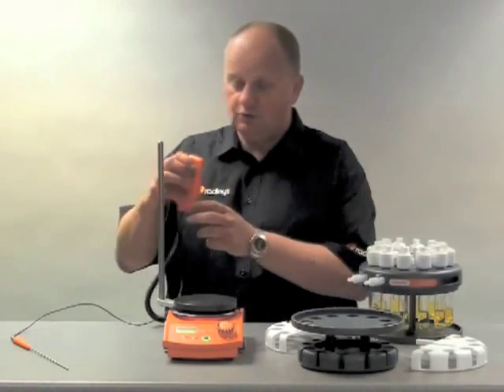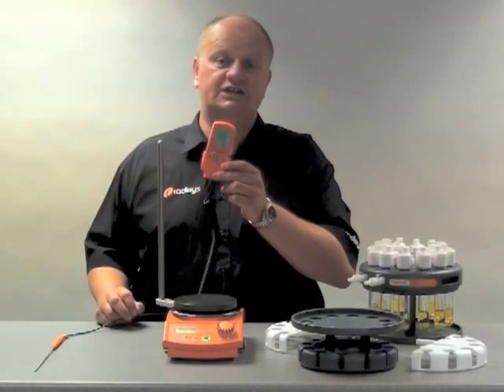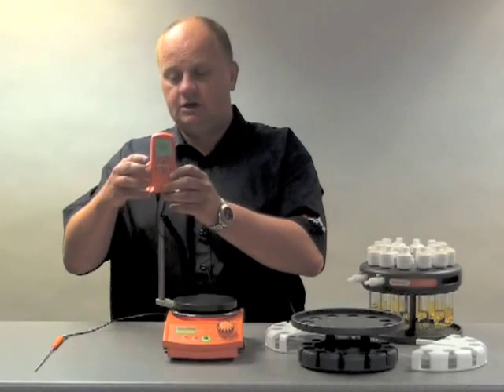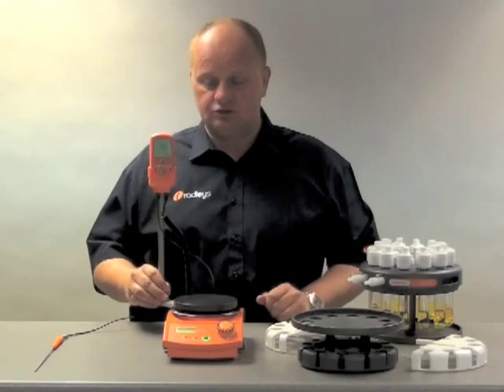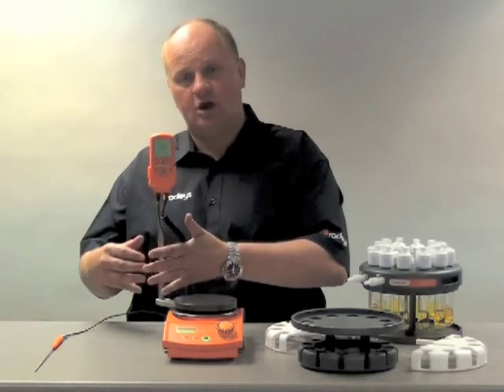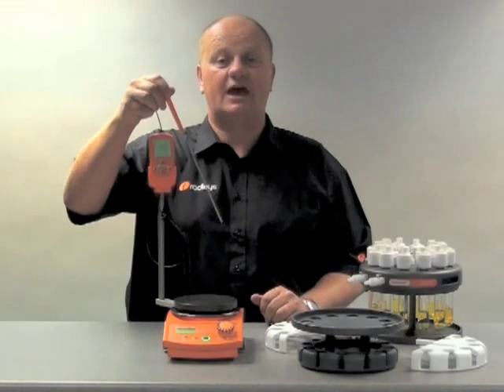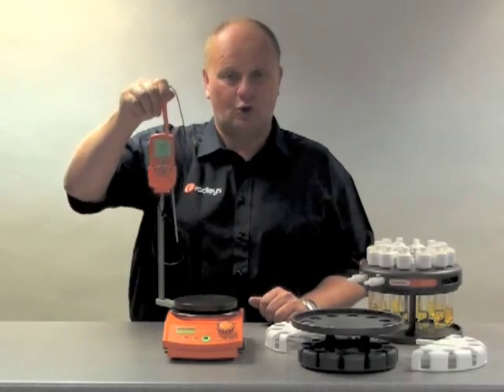The hot plates come with an optional Carousel Fuzzy Logic temperature controller, which is an essential tool when using the Carousel. The Fuzzy Logic clips onto this support here, which is supplied with it. This allows room for the Carousel to fit on top and for the probe to be slightly to one side. It uses a PT-1000 temperature probe which you can place into the solution or into the block.